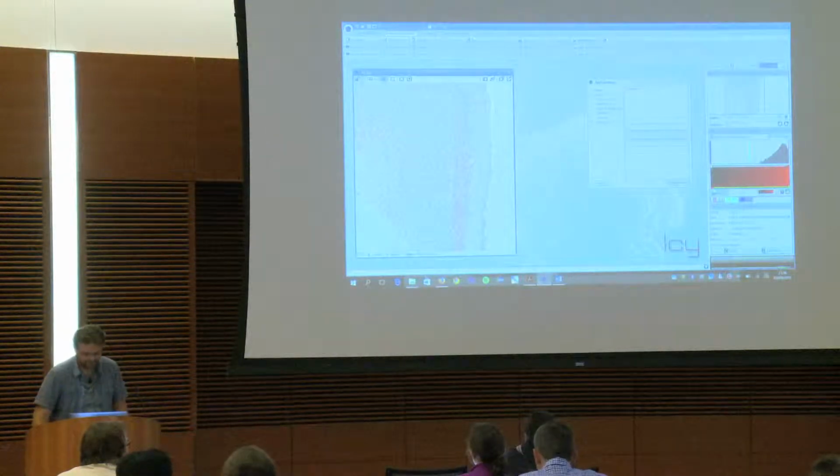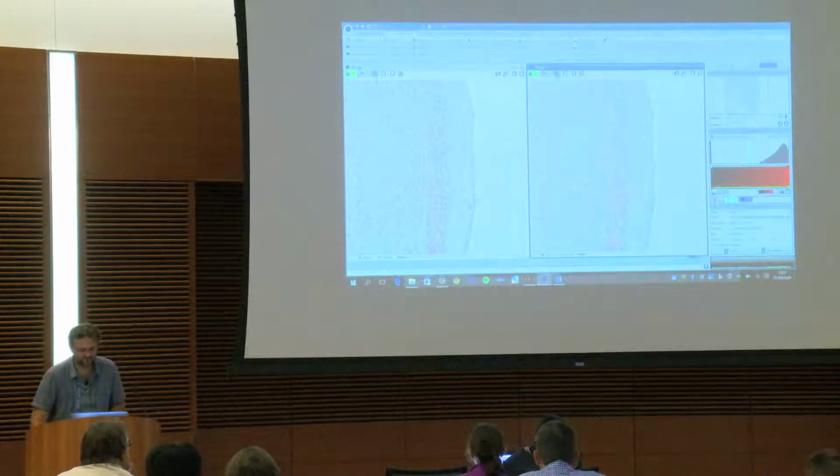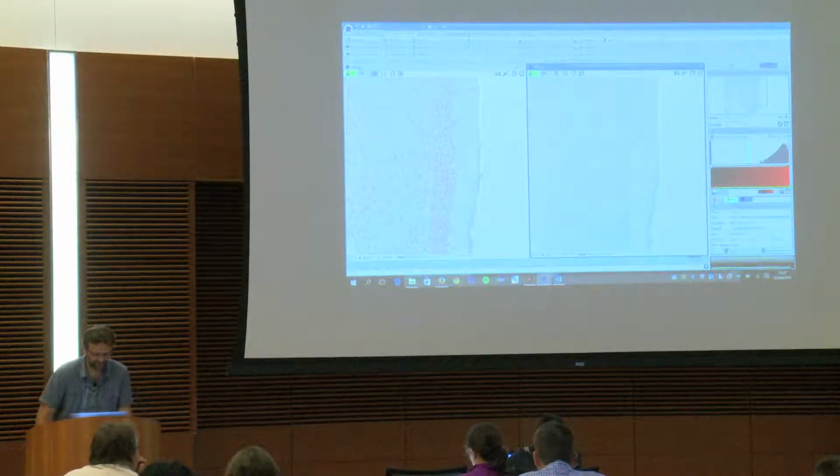So to help you, I will duplicate my view. I will synchronize it. And in here, I will remove the layer. Okay, it is this button when you don't want any more layer. Or if people are catching up, I will show you something that I like. No, okay, I will do it later.